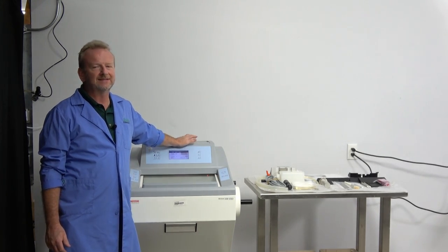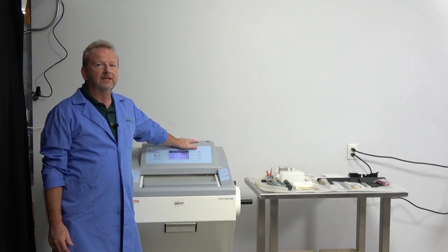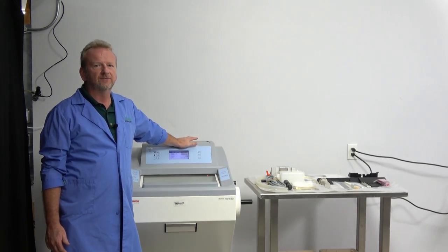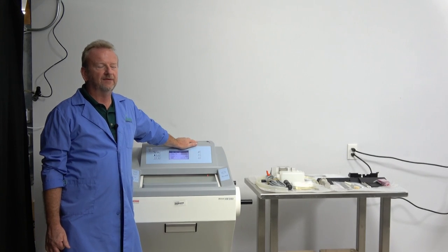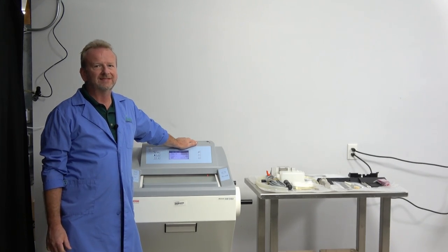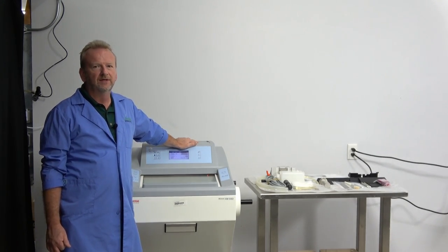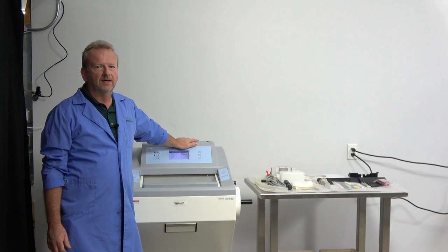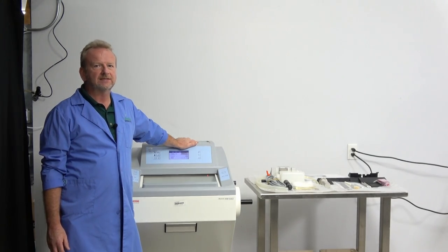This is not the current model, but we did get this one in. It was in the original crate, never had been used, been sitting probably in a warehouse for some years, but it works great. We did test it.